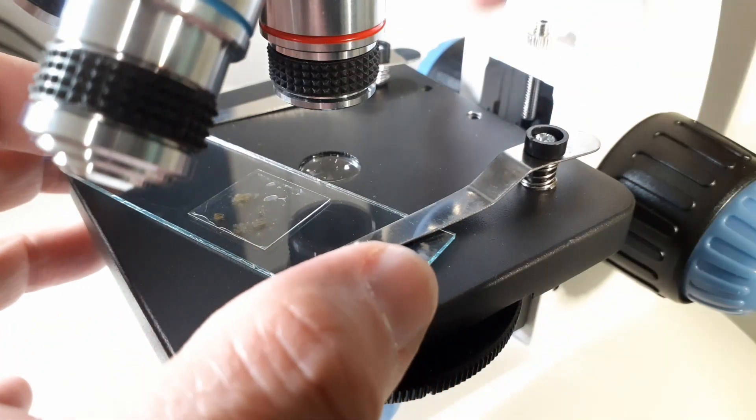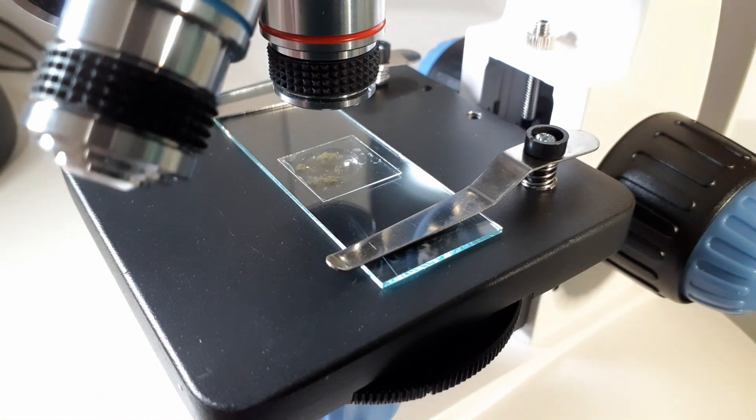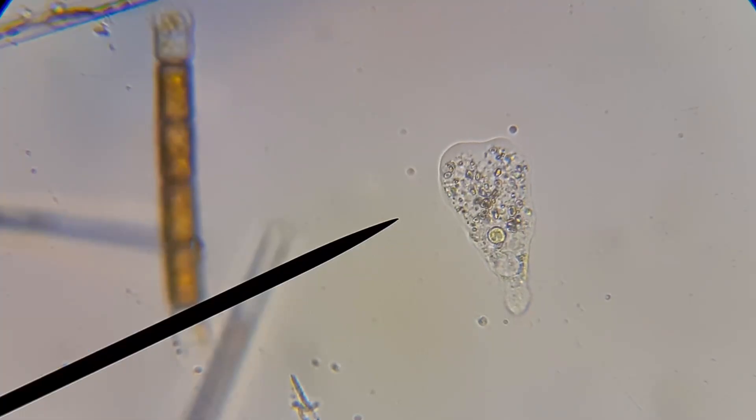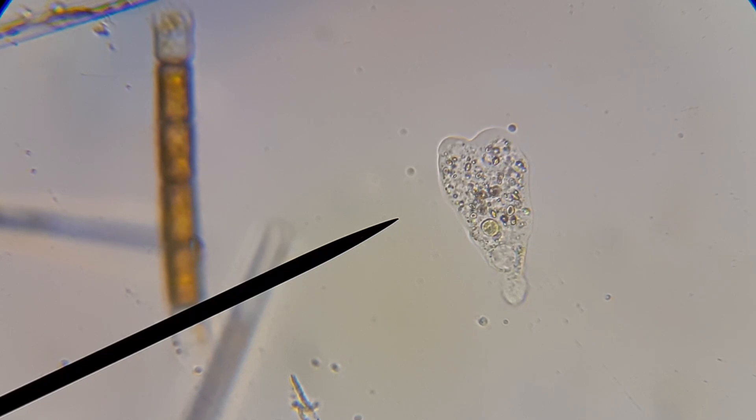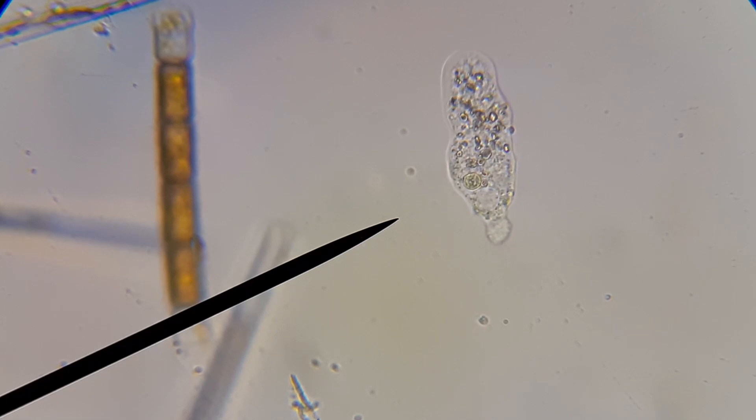I think we're now going to have a look through the microscope itself and I'm going to show you a nice little water sample. I prepared a little water sample with some algae, a jar of water that I keep standing on my windowsill. After a little bit of searching I found this amoeba. This is now taken with my mobile phone, now zoomed in a little bit more and you can see that the amoeba is quite nicely visible. This is now real time. This dark black line that you see there, this is a pointing arrow which is inside the eyepiece.